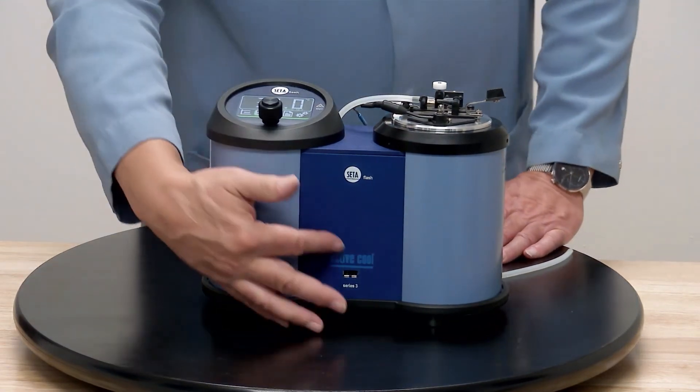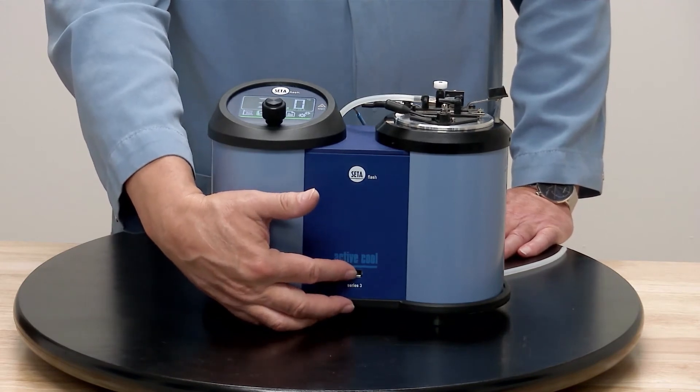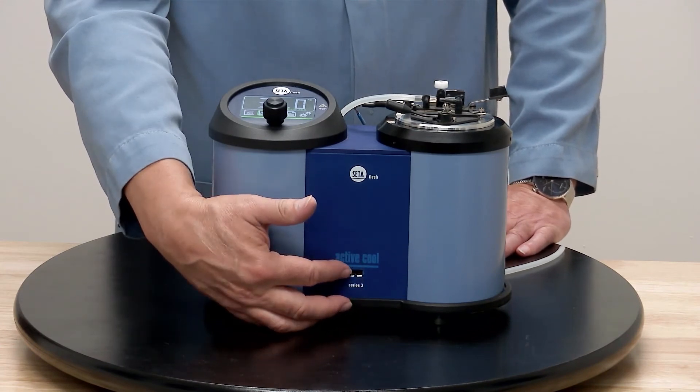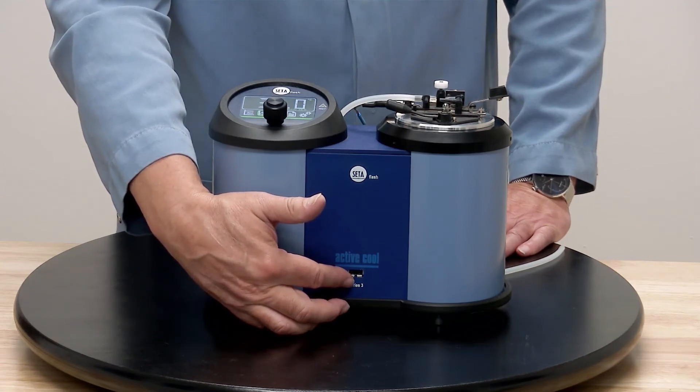In the middle on the front, there is a USB port. After you're done with a test and you have a number of results, you can transfer them to a USB stick and put that on your computer.